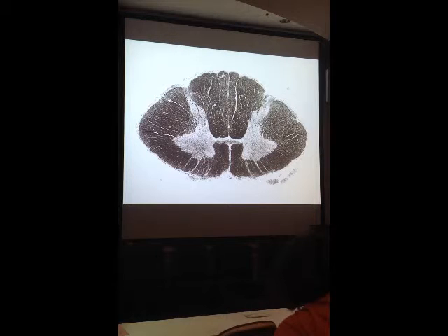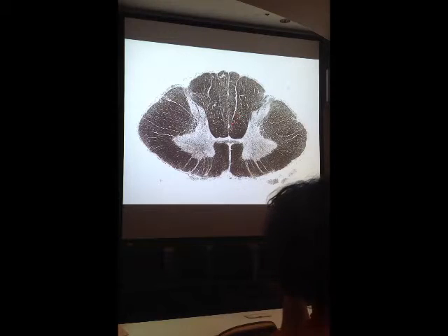That's the main one. Now, in addition, you can see, I think, quite clearly that there's a major ascending pathway structure that I'm outlining right here. What's the major ascending pathway structure that makes up most of this area through here? Fasciculus gracilis, and you should know that. In contrast, lateral to fasciculus gracilis, there's another major ascending pathway that fills much of this region through here, and that's what?